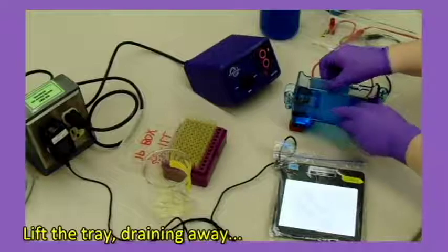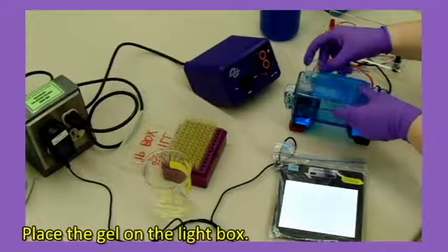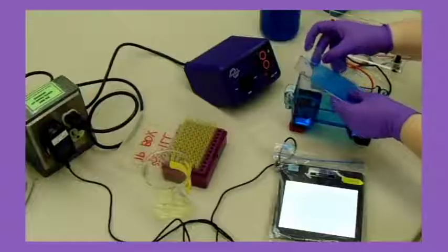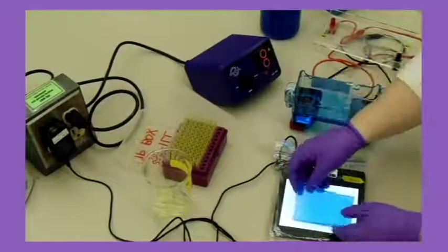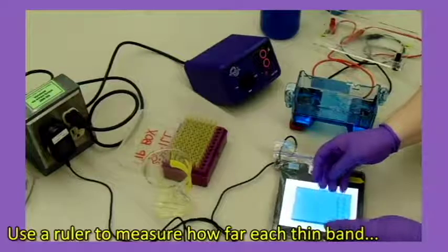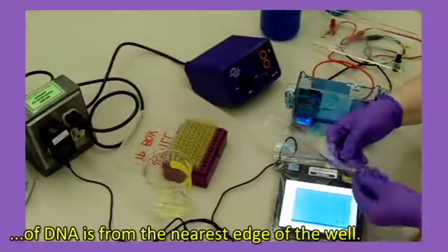Lift the tray, draining away as much buffer as possible. Place the gel on the light box. Use a ruler to measure how far each thin band of DNA is from the nearest edge of the well.